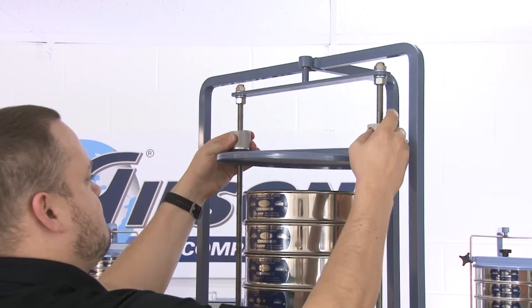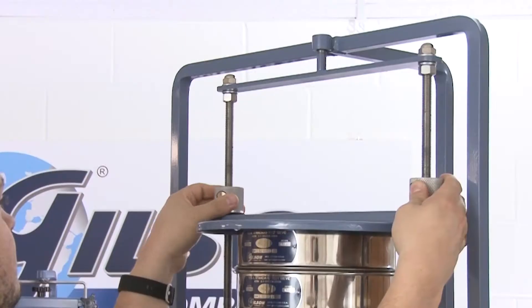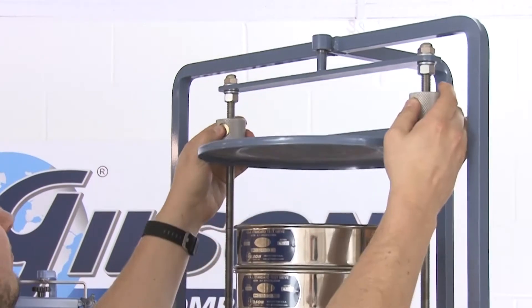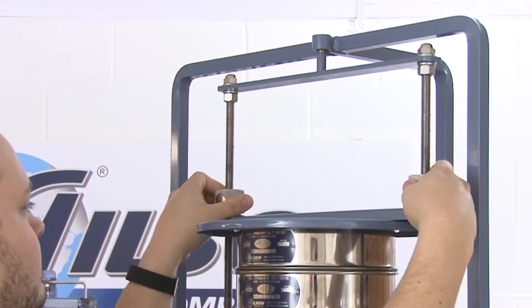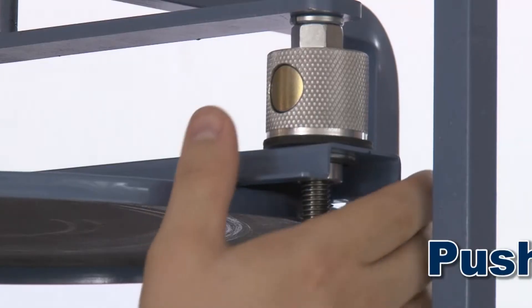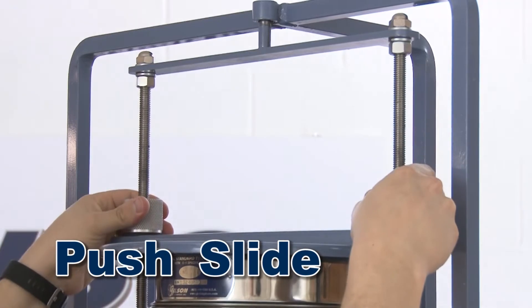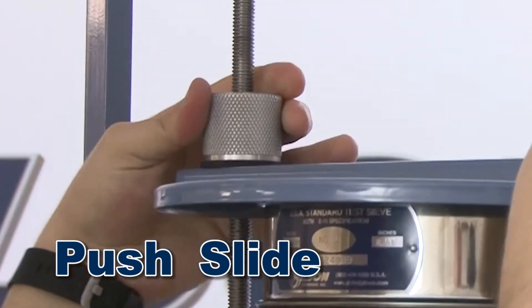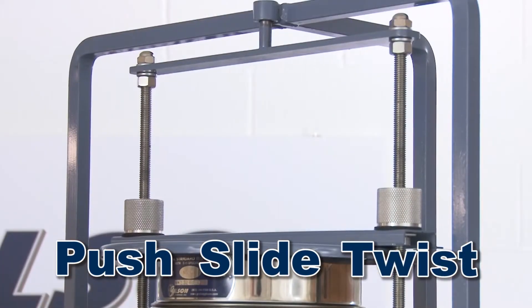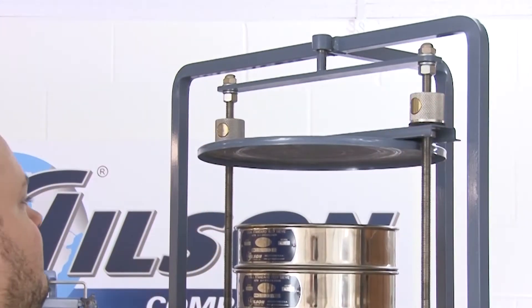Securing the sieves is as easy as pushing a button. Gilson's easy clamp system effortlessly slides up or down with no cumbersome knobs to work with. To secure the sieve stack, simply push the release button, slide the clamp assembly down to the sieve stack, release the button and twist to tighten. To release, simply push the button and lift.